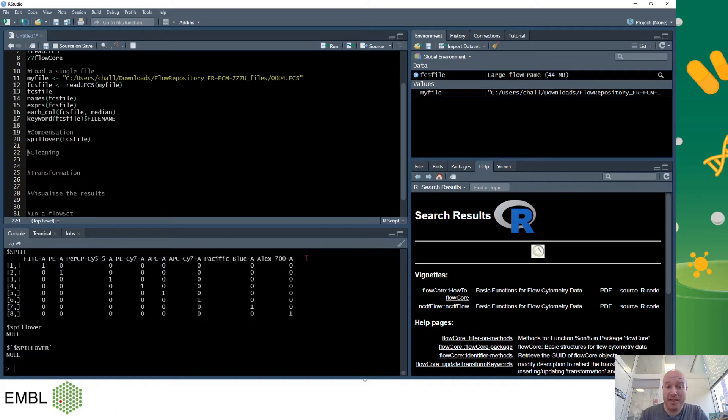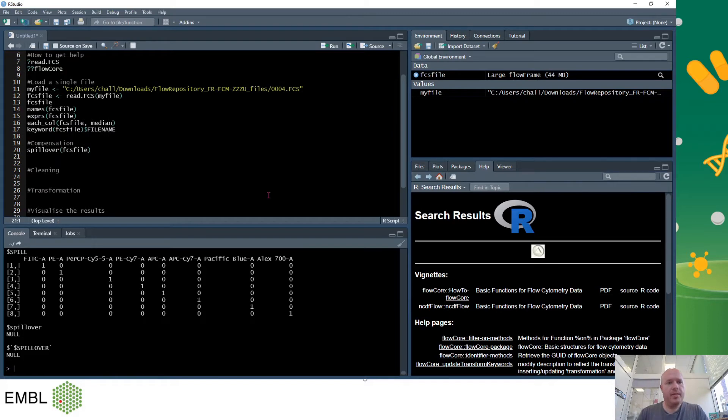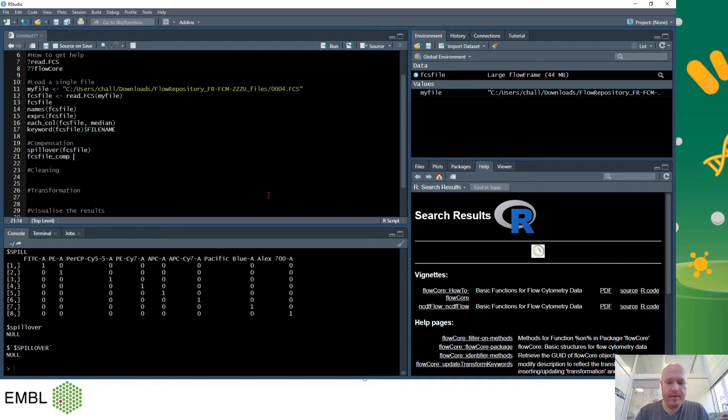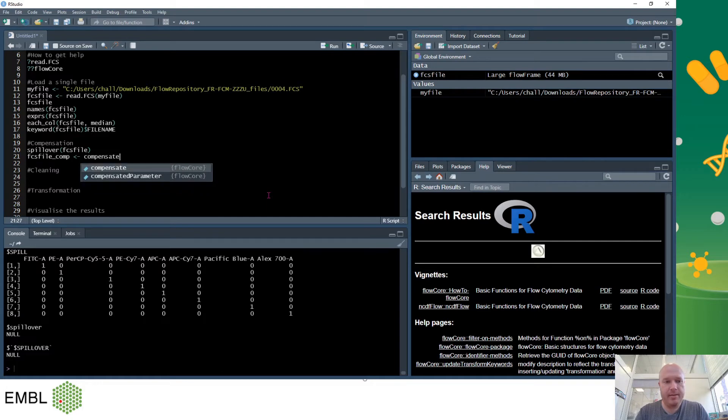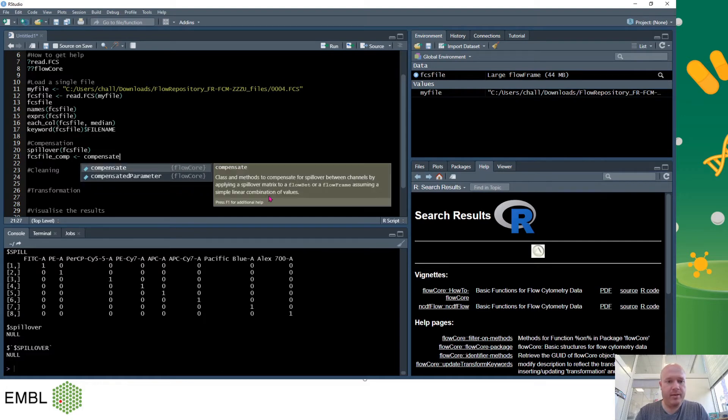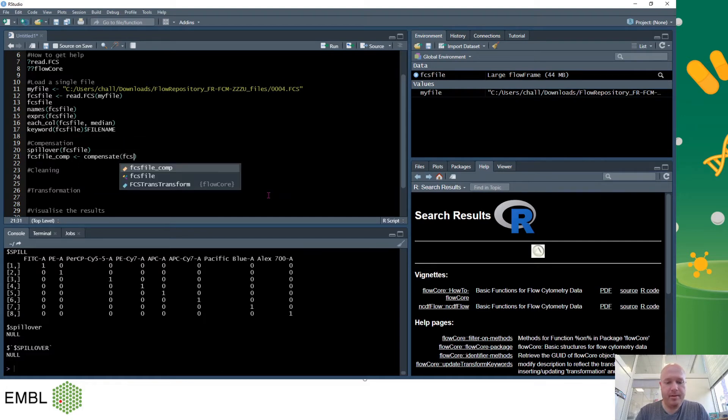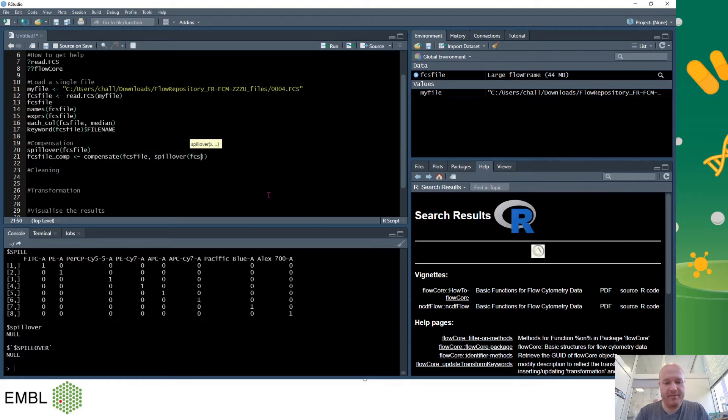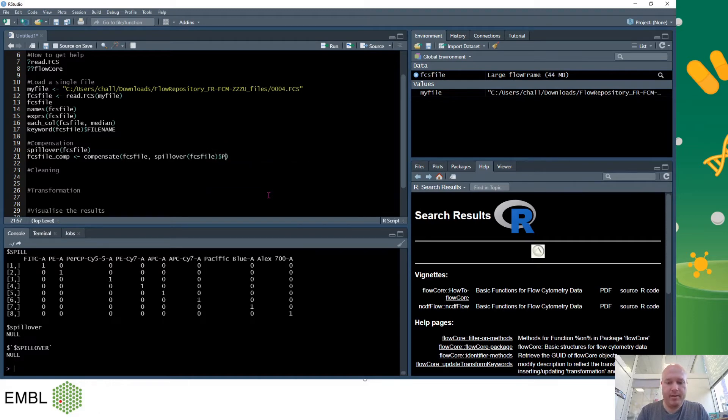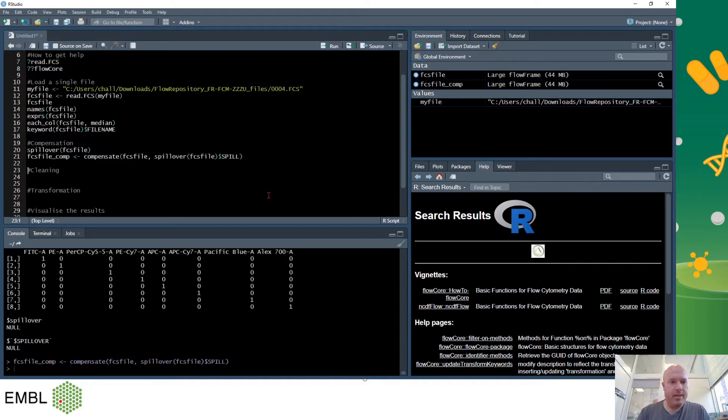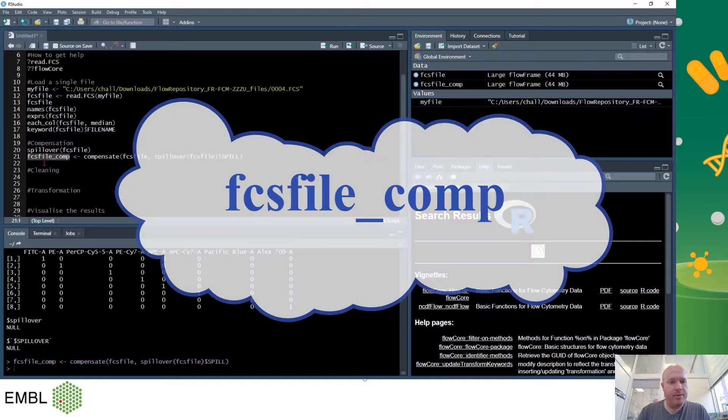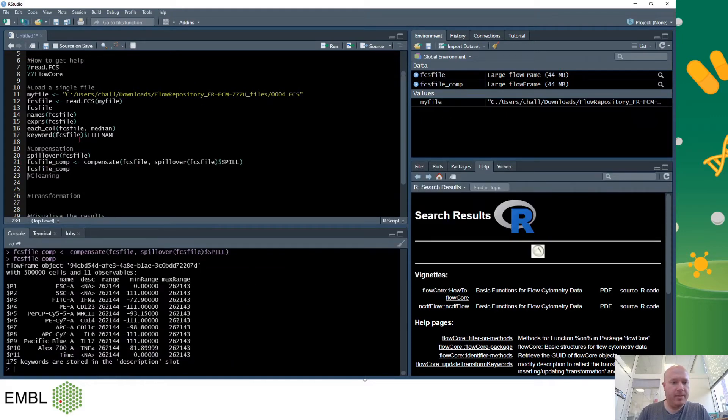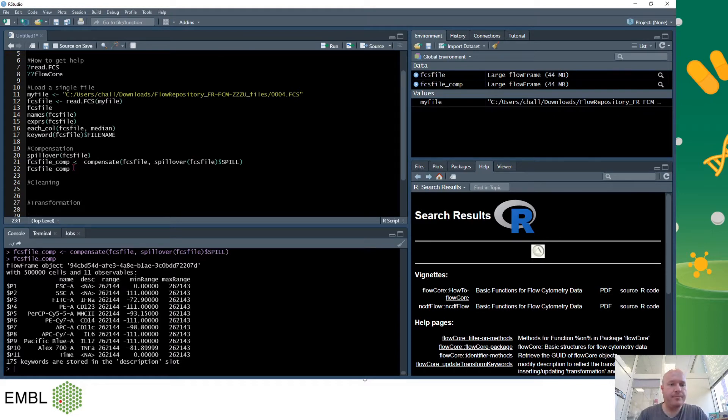And FCS file and this gives you the three spillover keywords that exist and so we can see our compensation matrix, which sadly has no data in it but it exists in this spill keyword. To compensate I will create a new variable called FCS file comp, use this arrow command to tell the computer that I want a new variable, and I'll use the compensate command from FloCo. So I will be compensating the FCS file with the spillover matrix from FCS file itself. And I know that the keyword is spill. So now I have made a new variable called FCS file comp which is the same size as FCS file but it is now compensated.